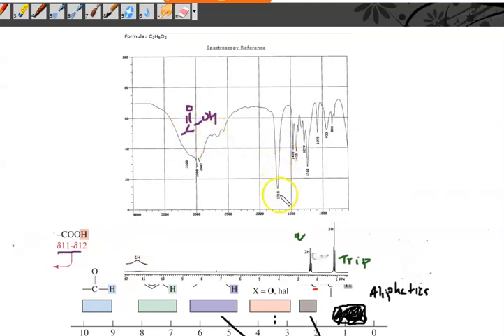All right. Also, we have a carbonyl peak. So this is kind of how I would want you to analyze it and put stuff like this. Either put a carbonyl or write the word carbonyl or whatever. Say carboxylic acid. That's basically all you get from the IR. So I know it's a carboxylic acid, and I got a carbonyl, obviously, because a carboxylic acid has one.